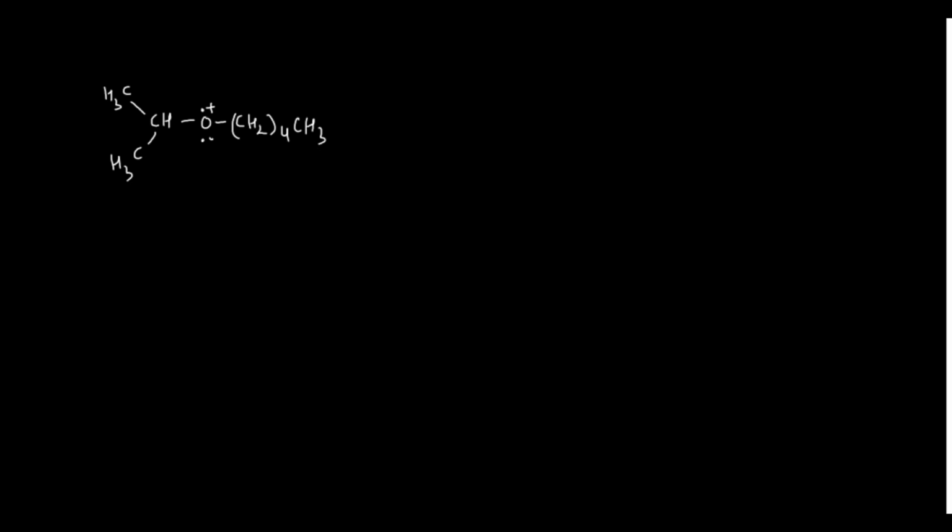Okay, so how am I producing this one? Beta cleavage. I will do the beta cleavage for this one. So what is beta cleavage? That means 2 beta bonds are there. One beta bond is here and another beta bond is this one. See, this is your alpha, this is your alpha. Just next to the alpha, this is beta, this is beta. So I can break this bond or this bond. Both will give you the same fragment. Please remember, both will give you the same fragment.